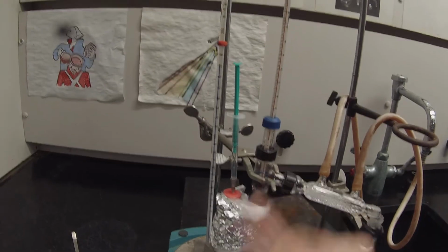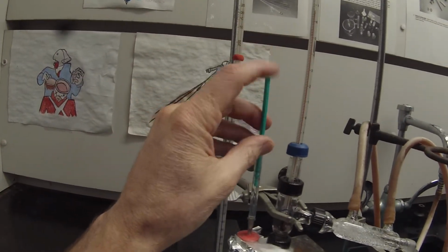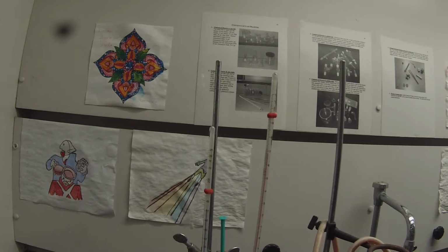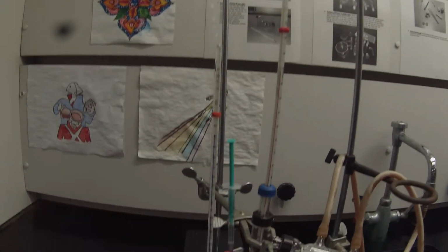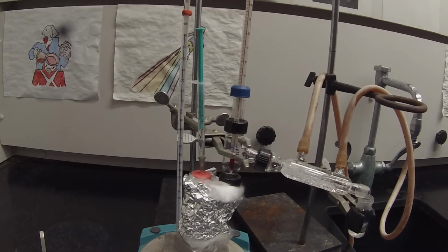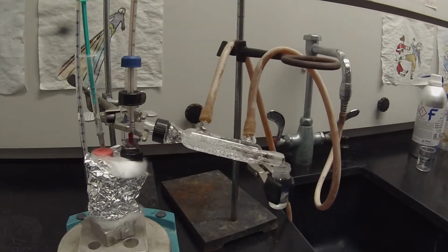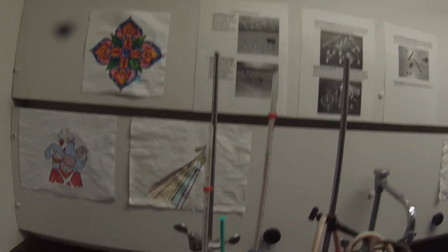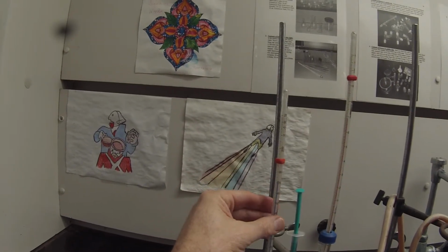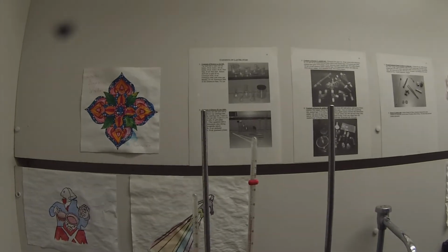I haven't wrapped this with glass wool, so that's actually being cooled by the airflow. And we'll add another half. You can see a bubble there of liquid trying to go down the condenser. Stable at 171 on the entire area. We seem to be fluctuating a little bit up there.